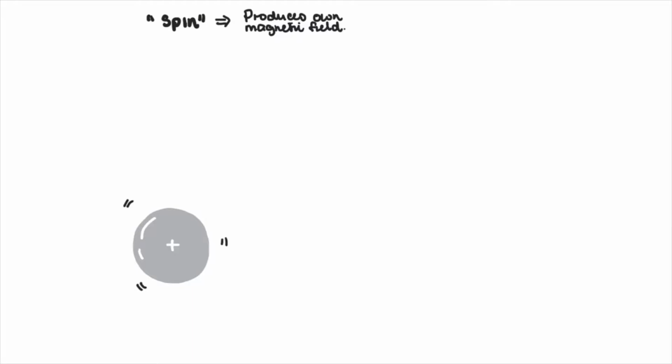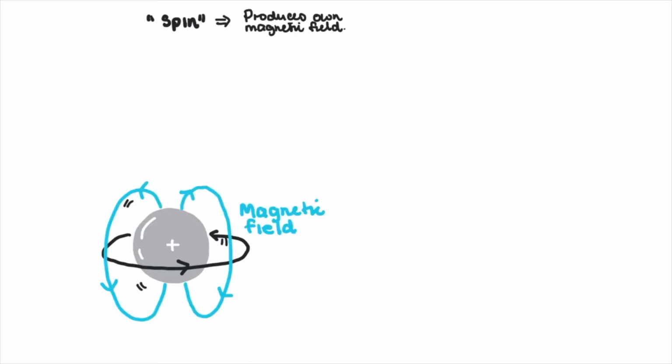If we focus on a hydrogen ion, which is just a single proton, because it's continually in motion, they move in such a way, which we tend to call spin, that they produce their own magnetic field. So if a proton is spinning in this direction, now this is heavily oversimplified, it creates its own magnetic moment in this sort of orientation.